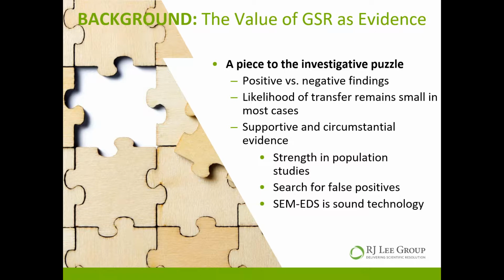And then on top of all of this other valuable background information on gunshot residue, the technology that is used to analyze gunshot residue has been around since the 1970s. It's scientifically sound technology and it's a confirmative technique. So overall, gunshot residue analysis is an incredibly valuable tool.